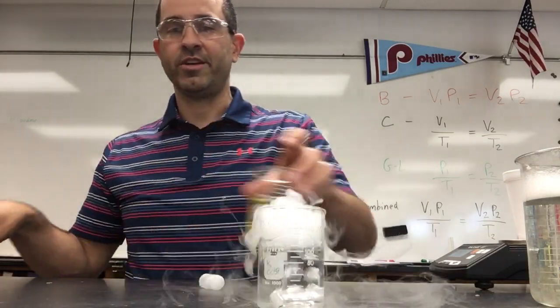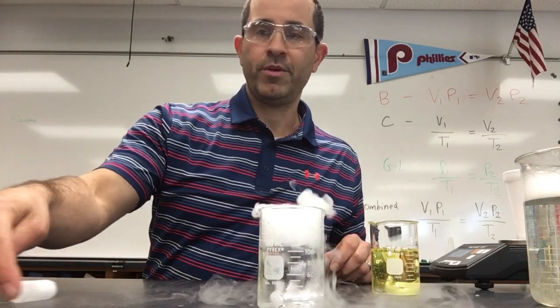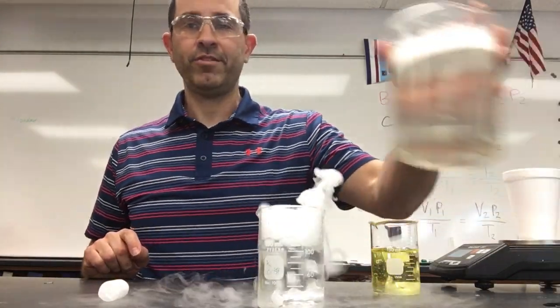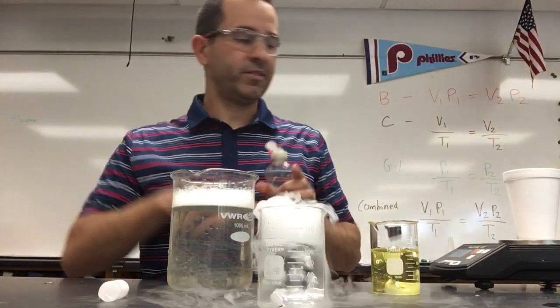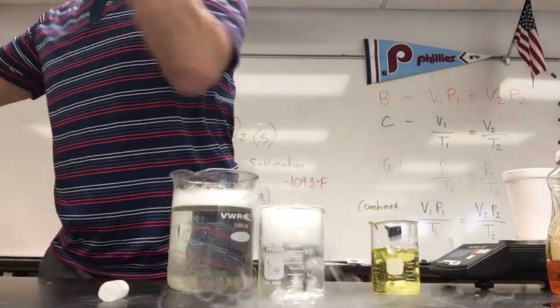And I want to show you this here. It's not quite ready to go. Let me just let this piece of dry ice hang out there on the table in front of us. And while we're waiting for it to do something, I have this beaker, and I put some good old dish soap in here, nothing fancy. And I'm going to drop in another piece of dry ice. I'll drop in a couple pieces actually.